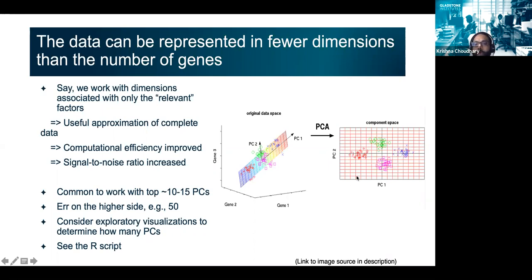You see the separation of those cells or samples in the direction of a plane. So if you reorient your cells or samples in terms of the plane, then you may be able to see the data and the relevant aspect of the data with respect to the plane. And here you see that there are 4 clusters of cells. So again, we will call this PC space or PCA space. PC space, I guess, is more appropriate.